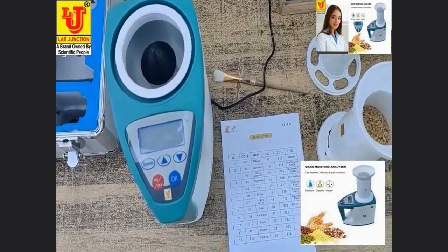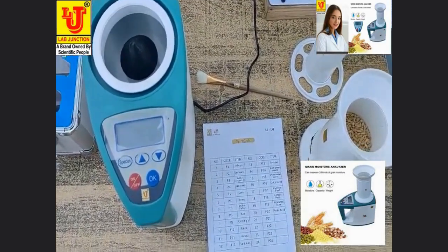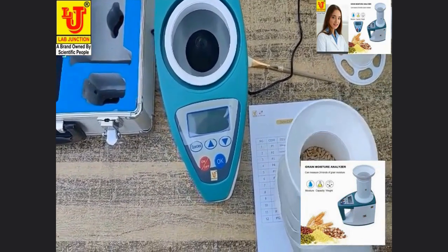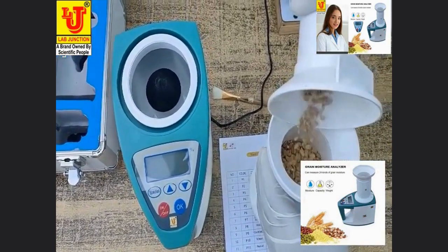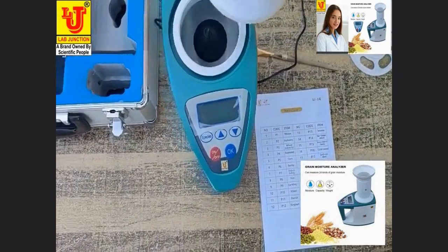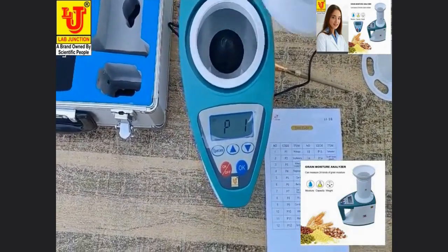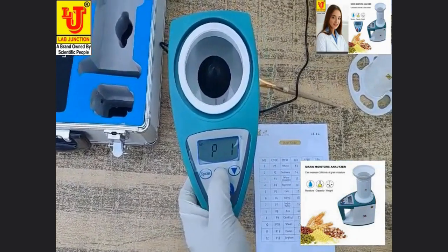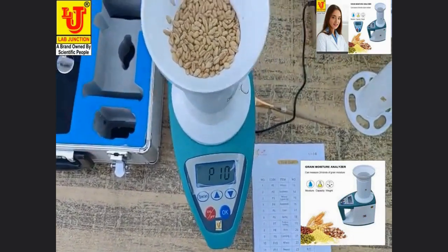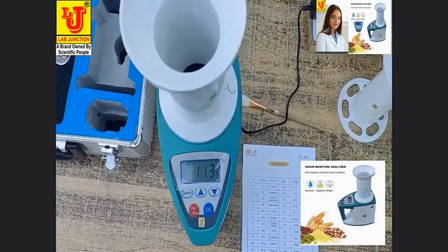Now I am measuring wheat moisture. Wheat item code is P10. Switching on the machine and selecting code P10 for wheat. Pressing the up key and then this key — directly moisture comes: 11.3%.